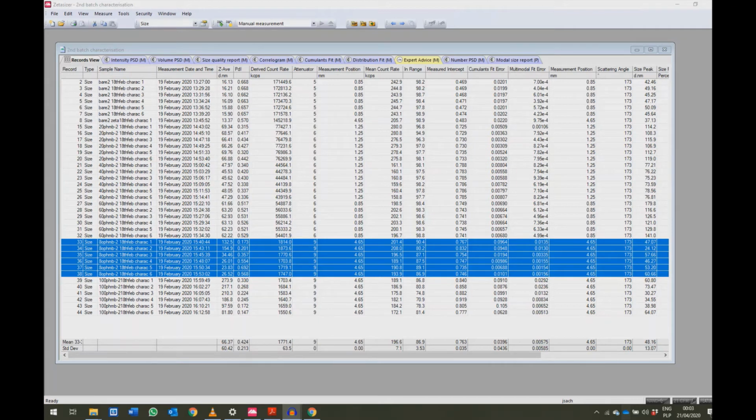With that, you can look at how much of the changes, because for example, parameters like in range will give you a percentage value and whether there is a change in that in range value or not. So the first step in the data analysis would be analyzing the change in the quality of data between your initial samples and then subsequent repeated measurements that you took over the weeks, over the course of the project.